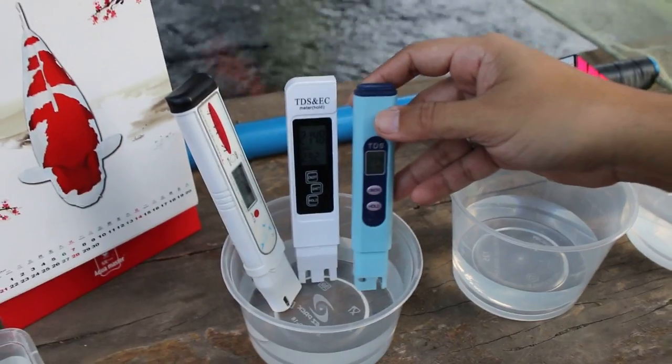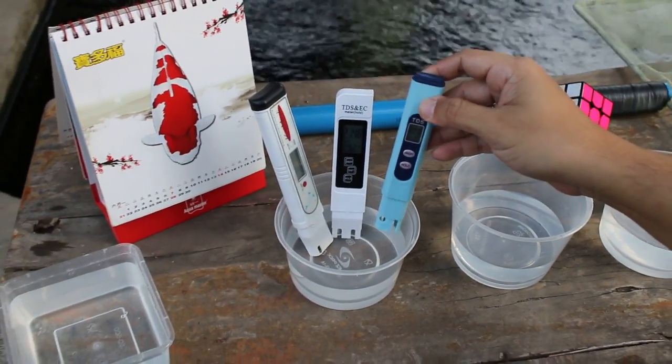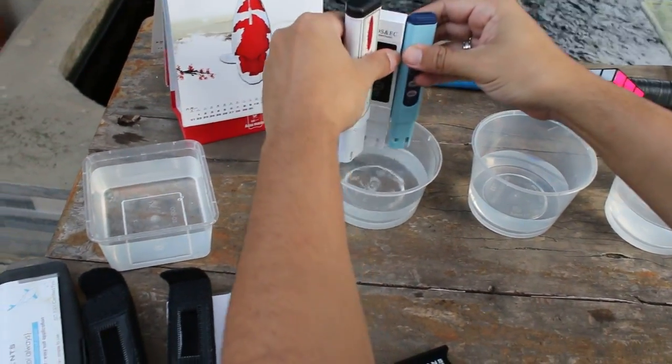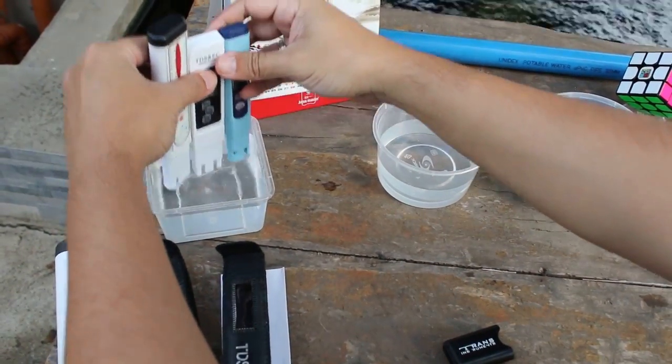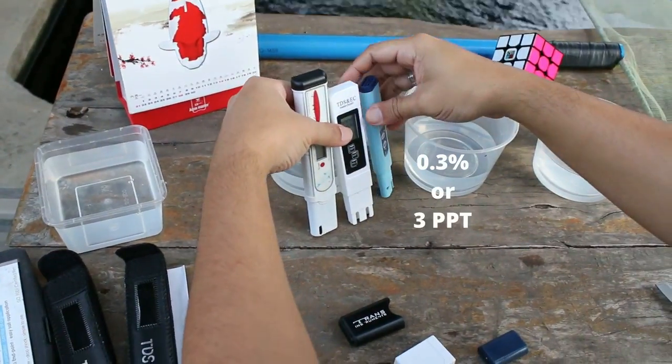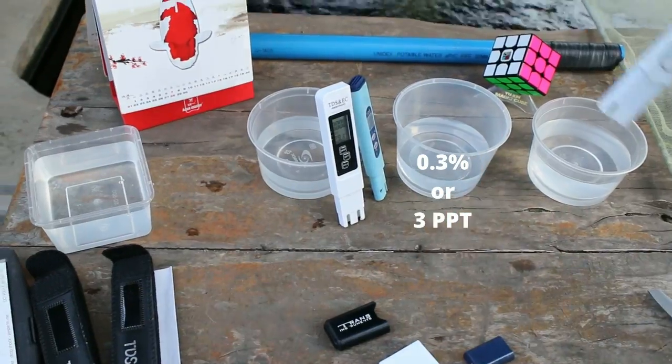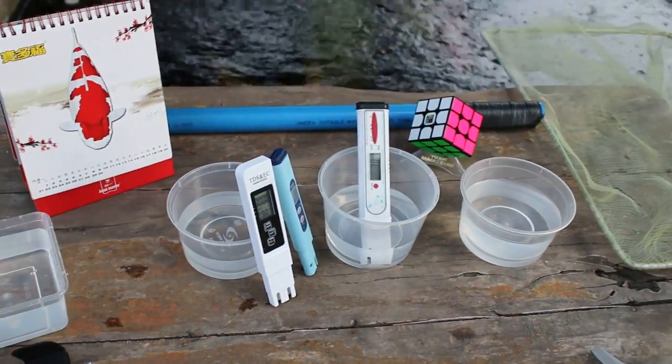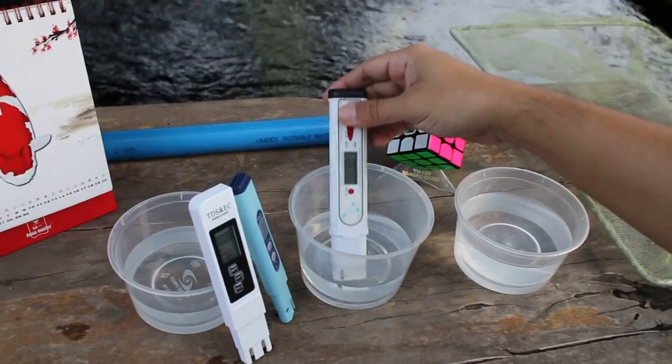Anyway, let's proceed to the next sample. Let's just give these guys a little rinse. Bullseye at 3.0 parts per thousand from the coin medic. Hope you can see it.